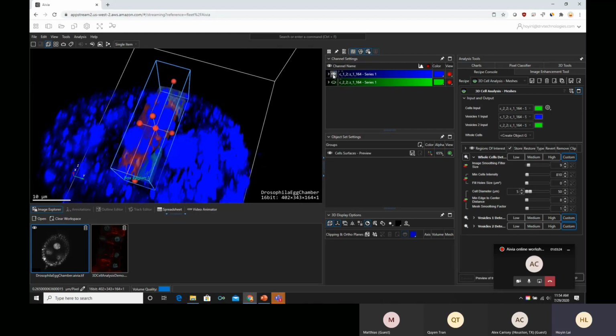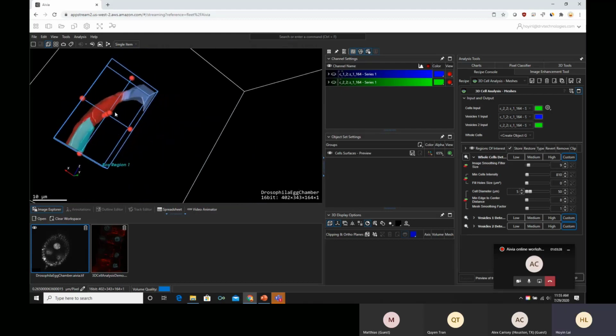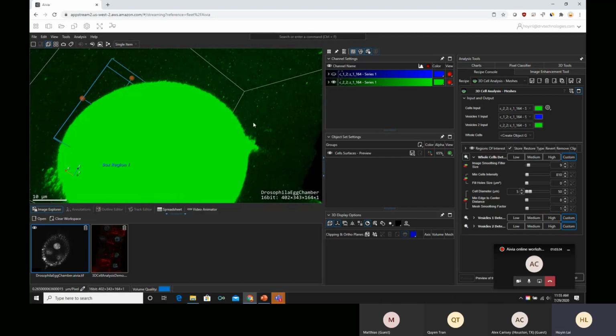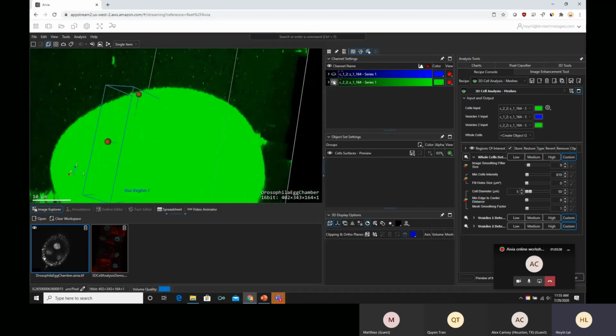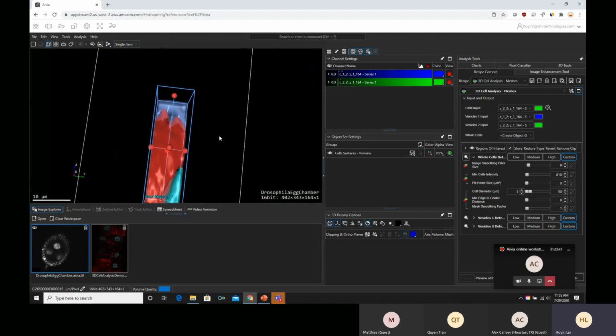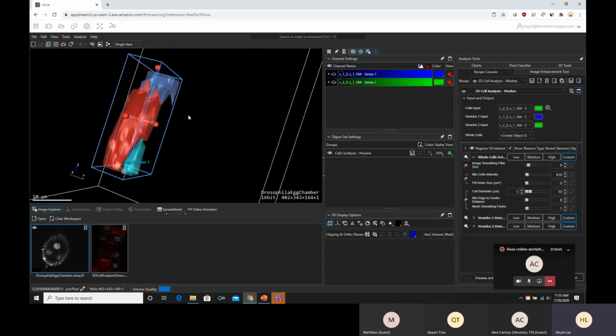All right, I'm going to turn off the blue channel. What I'm trying to detect is the whole egg chamber, so this would be from the green channel. This is basically what the whole thing looks like. Basically, it looks like an egg, right? That's the slice of detection I have.